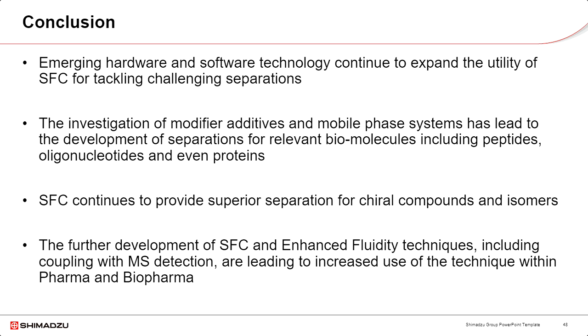We've also been able to see how the use of automation software allows for the investigation of multiple mobile phases and multiple stationary phases with great ease for the end user, and how we can use that to extend the technique that we normally think of for small molecules and chiral substances into the realm of biomolecules, peptides, oligonucleotides, and even proteins.